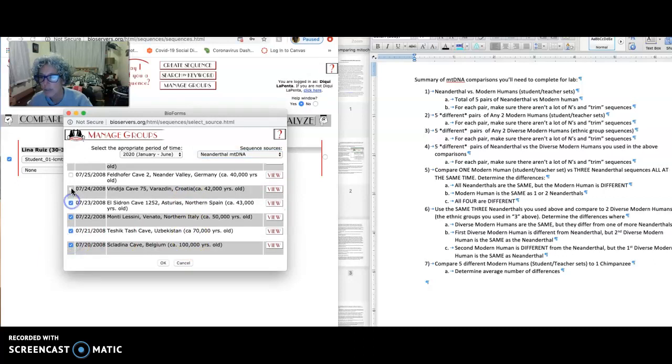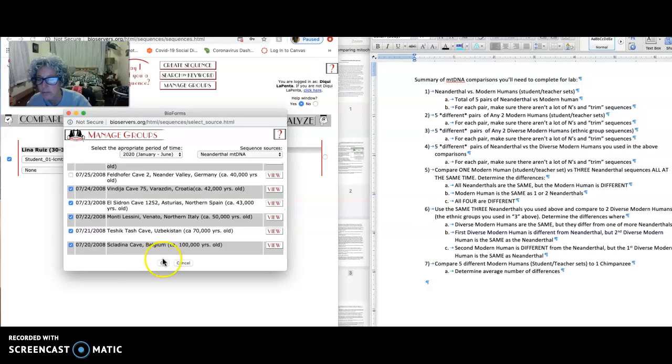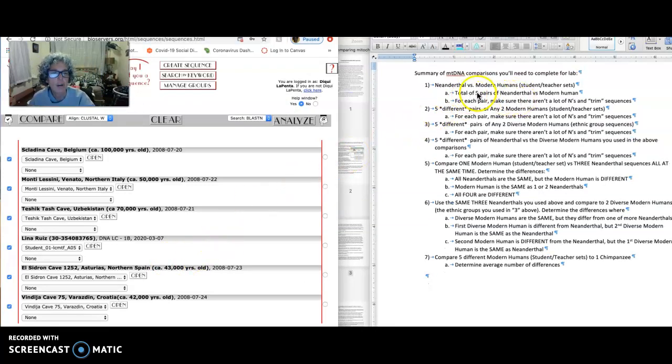I'm going to pick 1, 2, 3, 4, 5. So that's Croatia, Spain, Italy, Uzbekistan, and Belgium. That's a pretty good selection. So now I've got all my Neanderthals. And now I need to do 5 pairs. So one at a time, a student or teacher versus a Neanderthal. So I want to deselect this because I only want to do 2 sequences at a time.